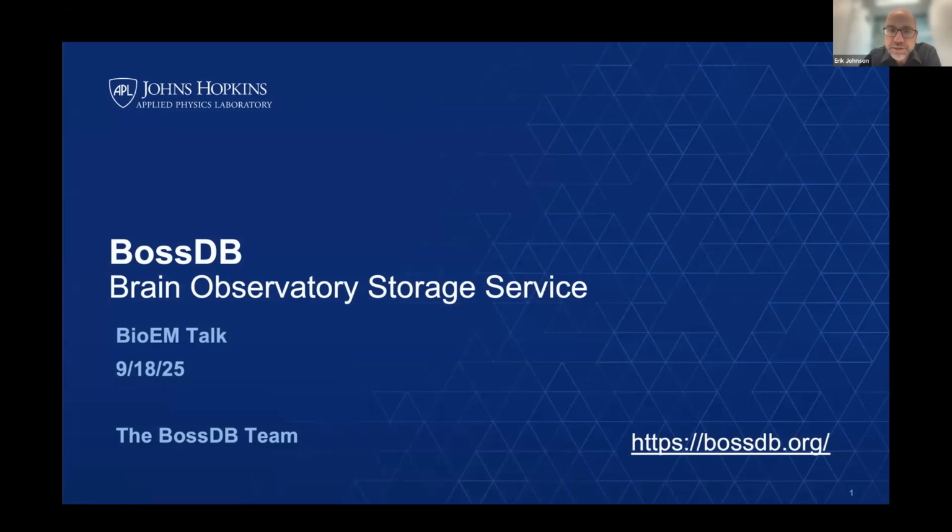I'm a research scientist here at the Johns Hopkins University Applied Physics Lab. I work on the BossDB team and our BossDB system, which I'm excited to tell you about today, the Brain Observatory Storage Service. This is going to be more of a talk about computational tools and storage solutions for the EM community, particularly in the neuroscience domain, but potentially has applications across a wide range of different arenas.